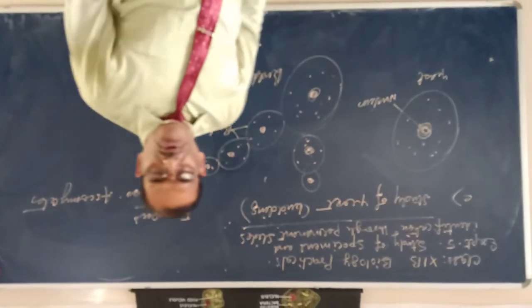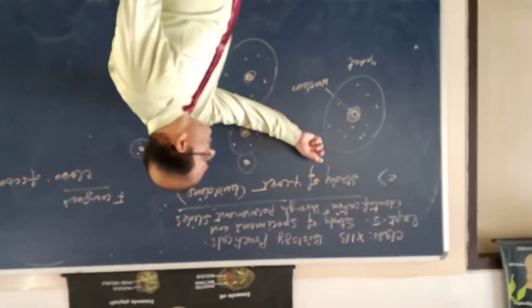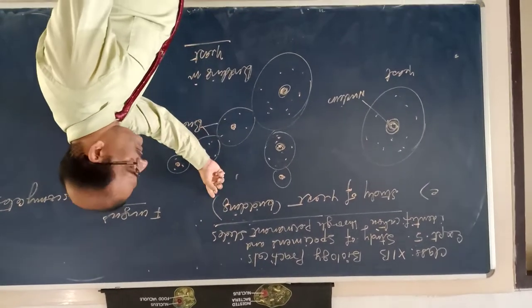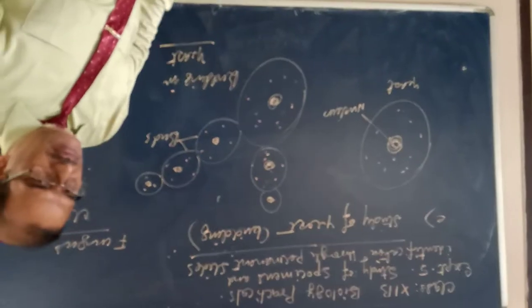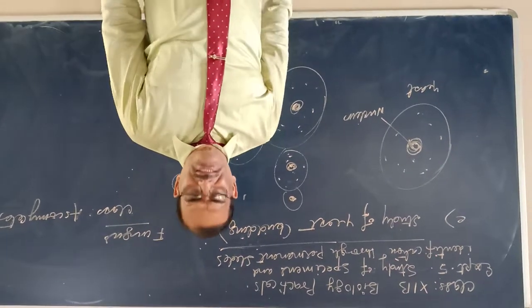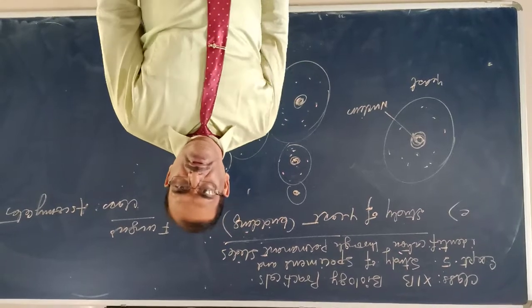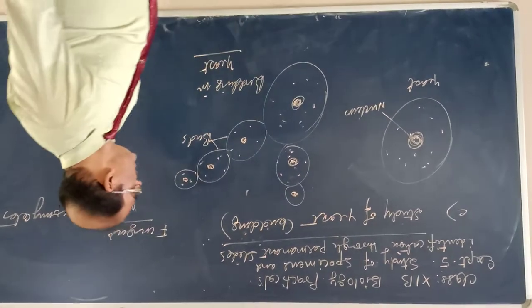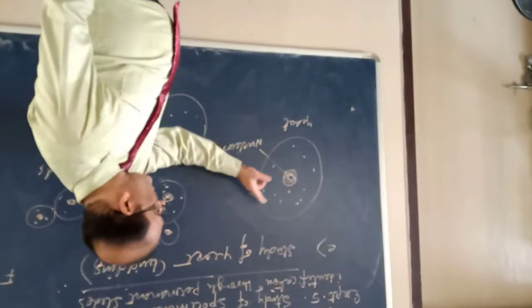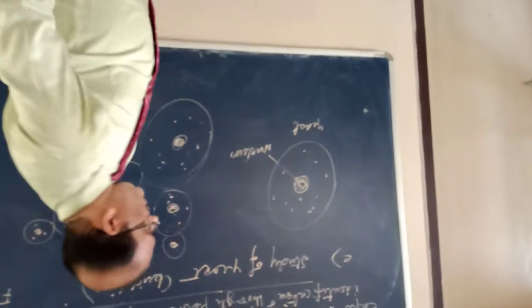Now students, we are going to discuss the fifth specimen, study of yeast showing budding. Yeast cell showing budding. You know that yeast is a kind of fungus, and yeast is a unicellular fungus. You see the cell. This is the single cell of the yeast. Nucleus, single cell. So it is a fungus.